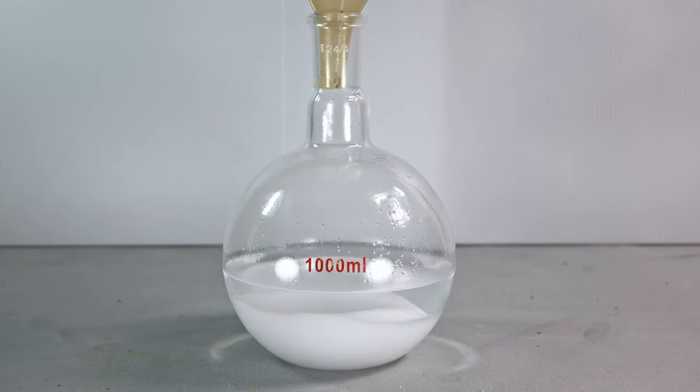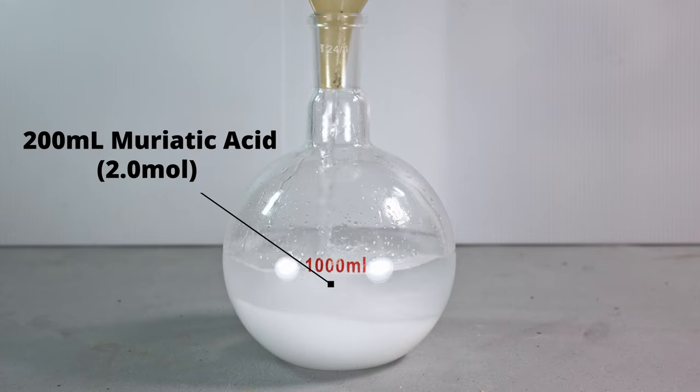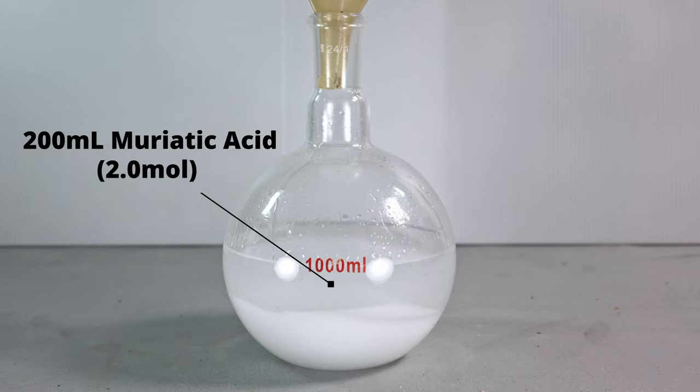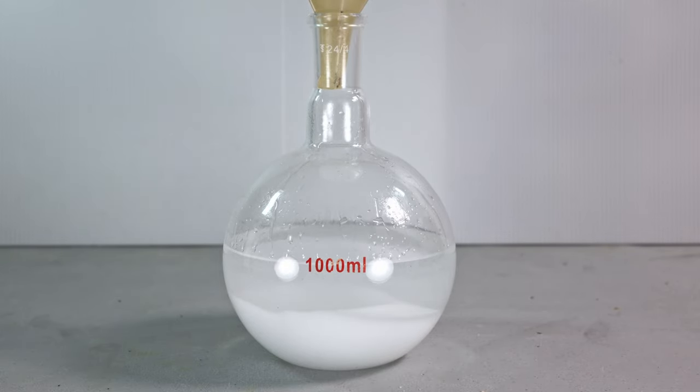Now I'm going to pour in 200 milliliters of muriatic acid. Not only does this provide extra hydrogen chloride, but with the water content in it, it also provides a buffer so all the hydrogen chloride doesn't escape when I add the sulfuric acid.